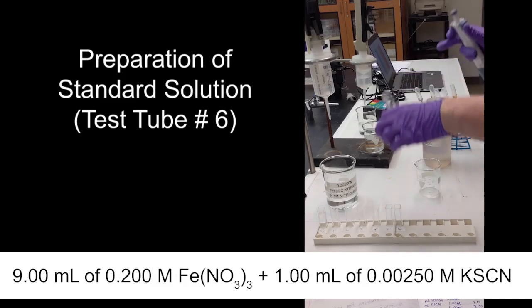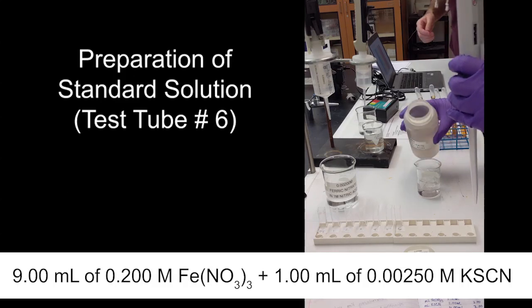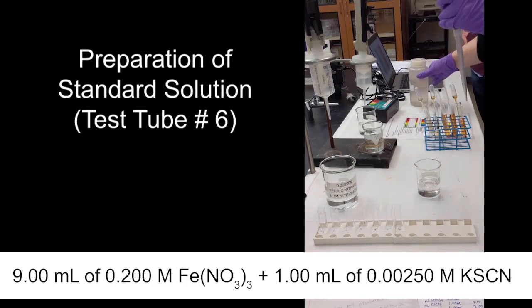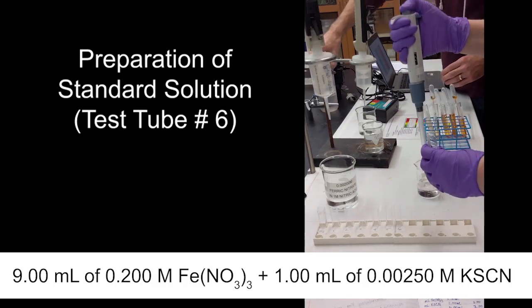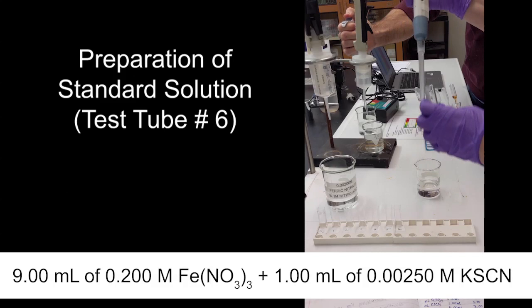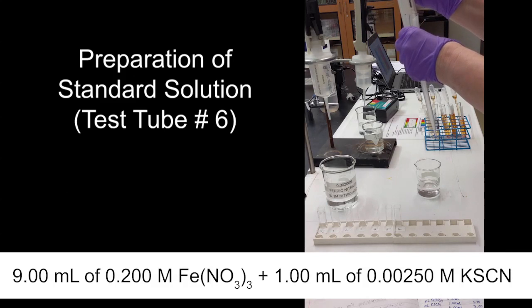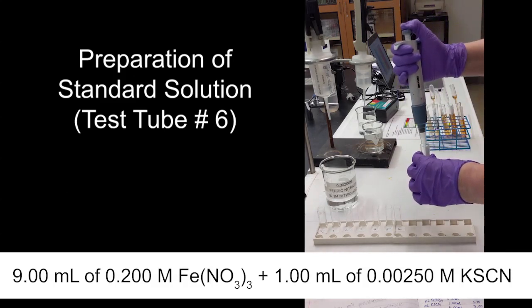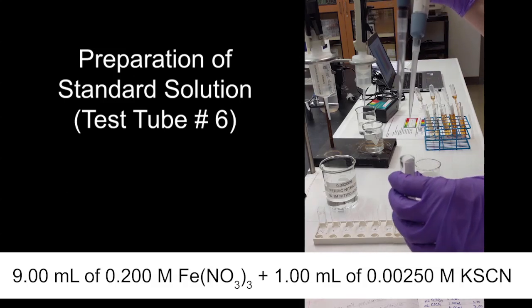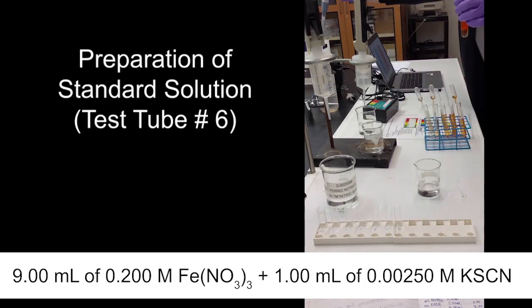Transfer it to a secondary container. I never want to pipette directly out of the stock solution. So this is currently set to 5. So I need 9, right? So 5. And then I'm going to dial this to 4. Okay, now we need just 1 milliliter of the thiocyanate.